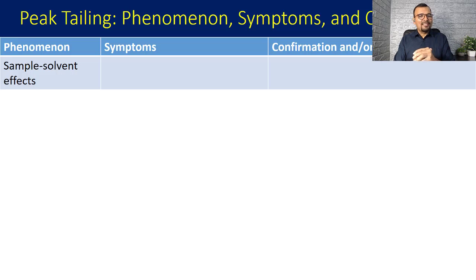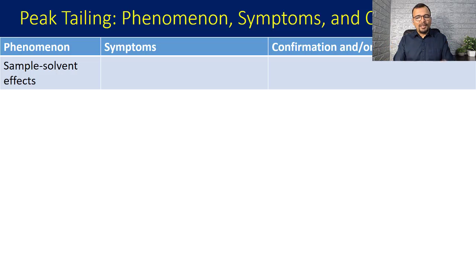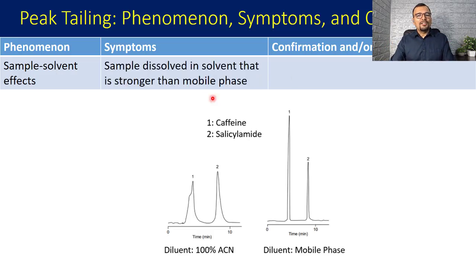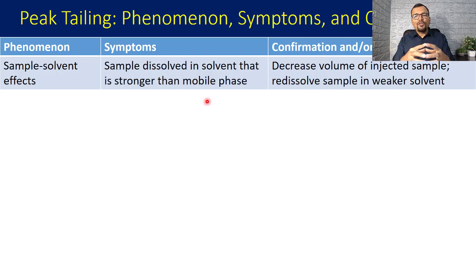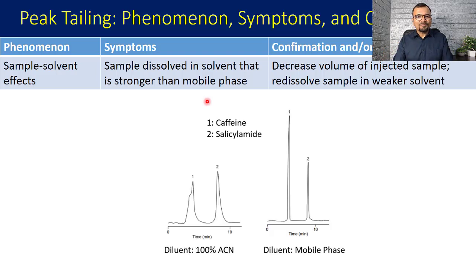The last phenomenon is the sample solvent effect. The sample diluent is very important for getting symmetric peaks. If your sample diluent is stronger than your mobile phase, you are going to have peak distortion or tailing. The correction is to decrease the volume of sample injection or re-dissolve the sample into a weaker solvent. For example, in the analysis of caffeine and salicylamide, when 100% acetonitrile is used as diluent both peaks are distorted or tailed, but when the mobile phase is used as the diluent the peaks show a symmetric shape.